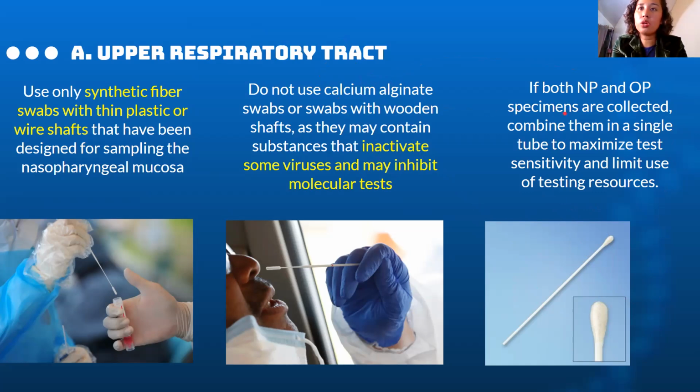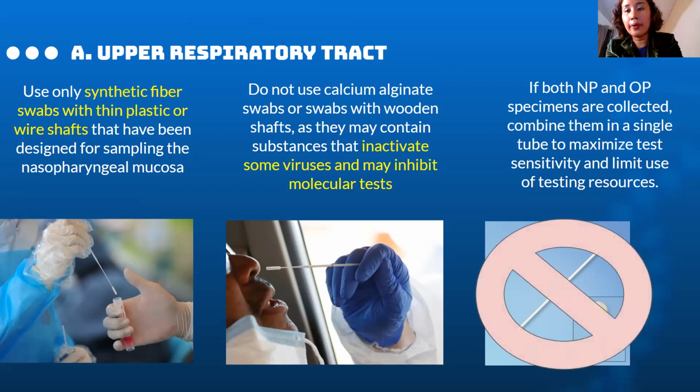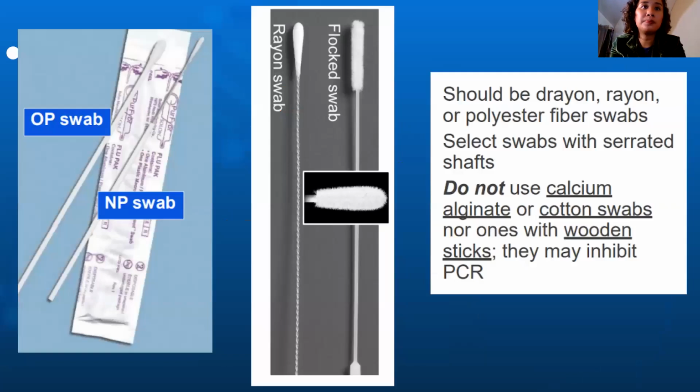So if both the nasopharyngeal and oropharyngeal swabs are collected, combine them in a single tube, okay? To maximize test sensitivity and limit the use of testing resources. I'll show you later a journal na mas maganda daw pag pinagko-combine yung NP and OP specimens. Okay, so calcium alginate swabs are a no-no.